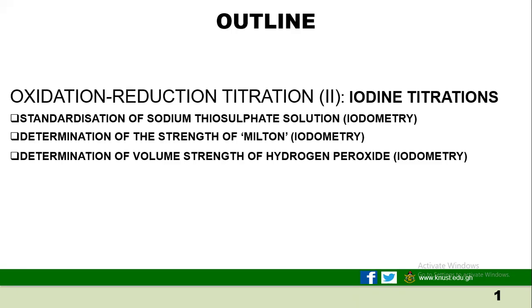Good. So, as we always know, before we use any reagent at all in a titration, we first standardize, right? We standardize against a primary standard. After the standardization, what we have to use in our further titration is called a secondary standard, right?